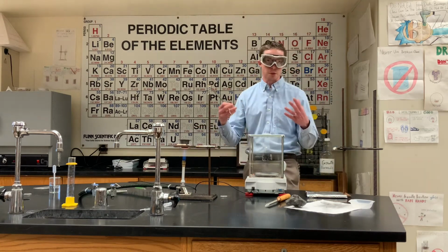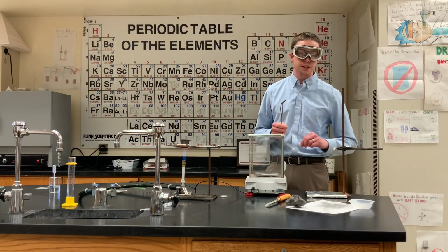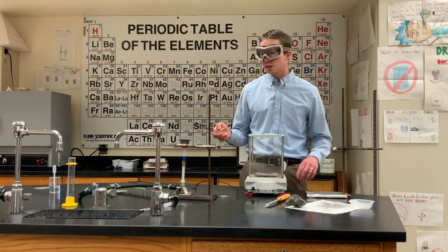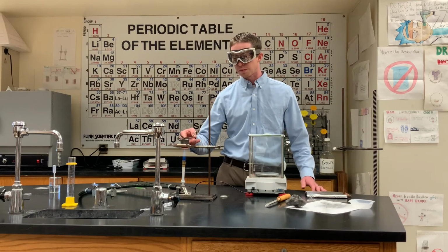Okay, we saw a little bit of smoke coming out. It's probably a very small amount of the product, magnesium oxide, that we're forming, so we don't want to just let that disappear into the air. Keep the lid on, just cracking it occasionally.